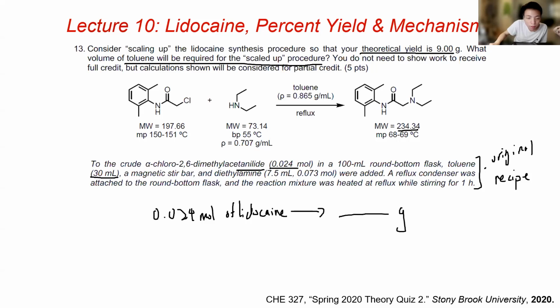This is lidocaine. That'll be 5.62 grams of the lidocaine.